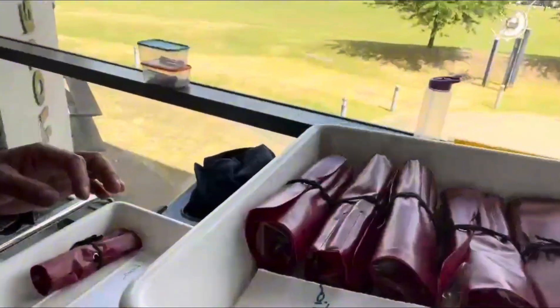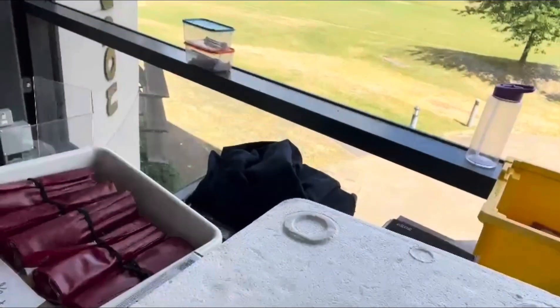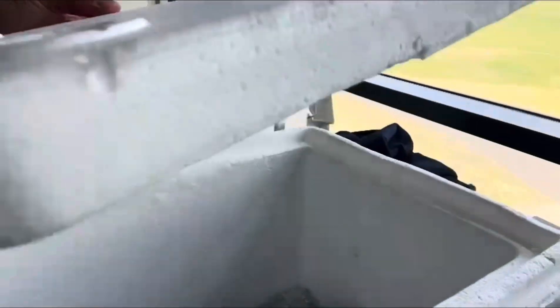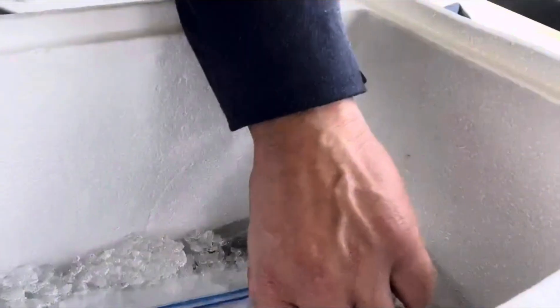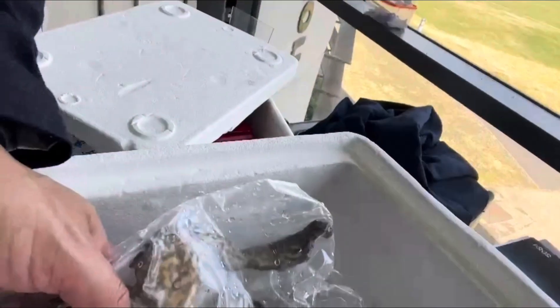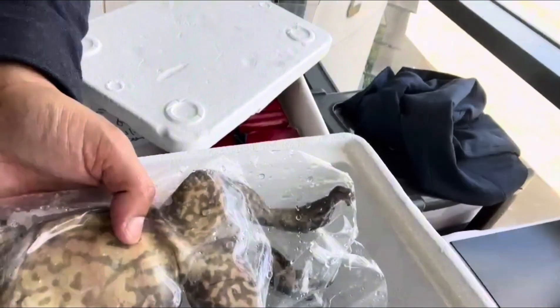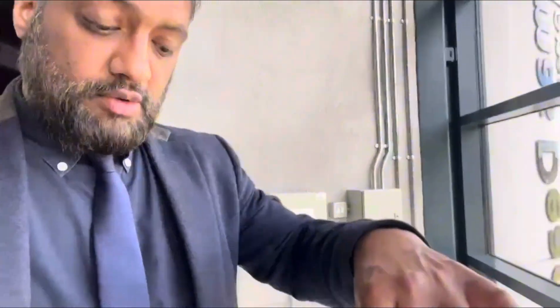Look at that — dissection kit, some trays, and then these are these. So this will be interesting to see. They're going to be doing a frog dissection. I'm going to show them how to do it. You can see the size of the frogs — they're huge. I think they start to smell a little bit as well. We need to get them dissected today, all done.